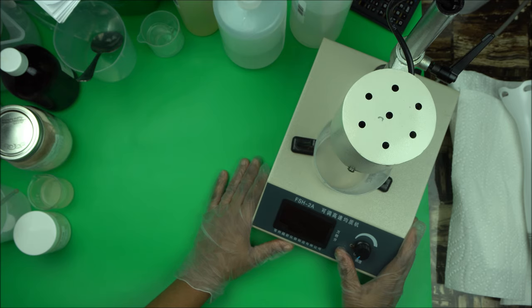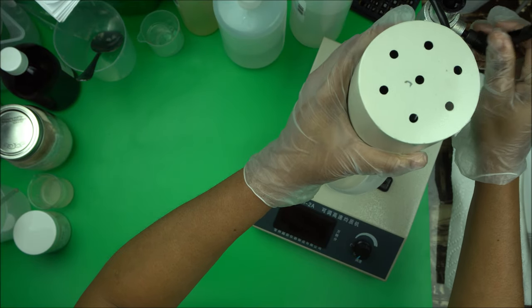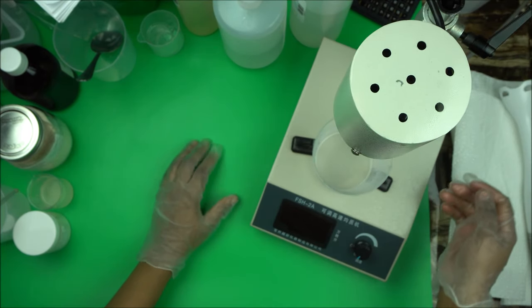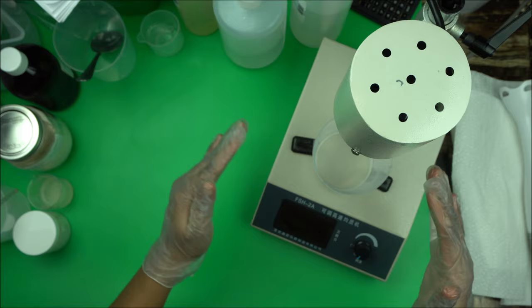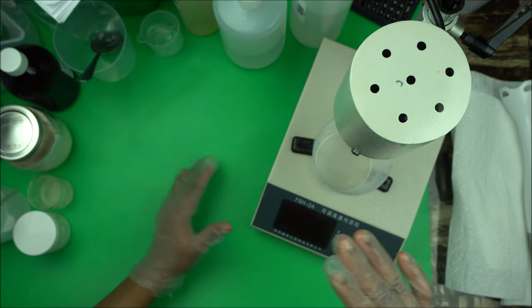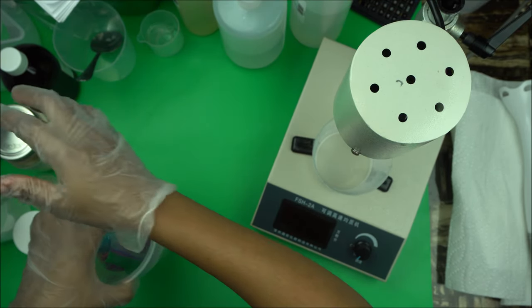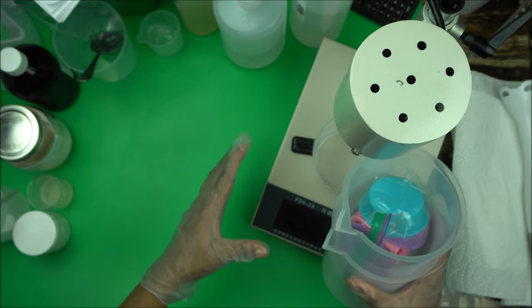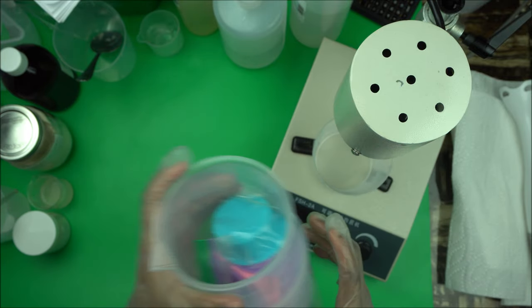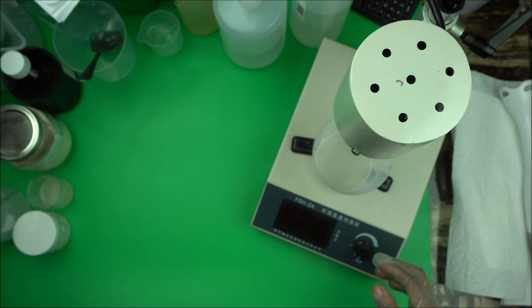You don't need an overhead mixer, and you can see this homogenizer. You can take it all the way up, especially if you have to use a bigger beaker. If you want to use a bigger beaker, you can take it up.